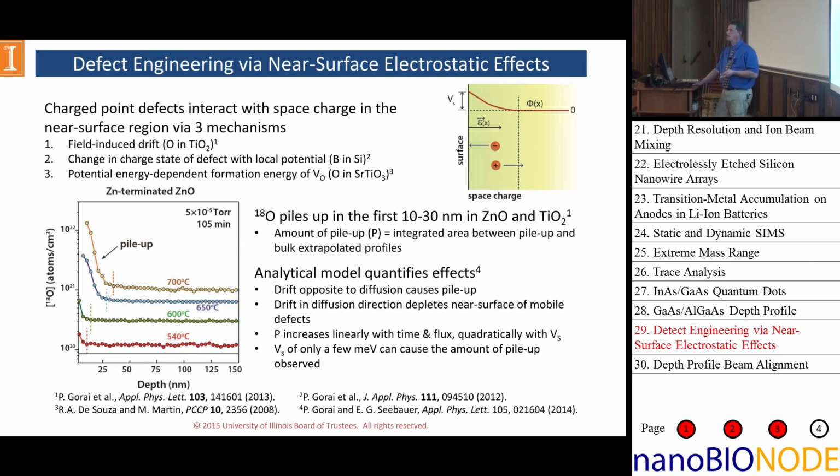Now, when doing depth profiling on the TOF SIMS, you have to be very careful, because we're actually going to align both the analysis beam with the material removal beam. Ideally you want something that looks like this: a nice big crater that's flat on the bottom, with everything at the same depth. But a more realistic crater shape for the TOF SIMS has some bending, so the only area that's good for measurement would be here in the middle that I show there.